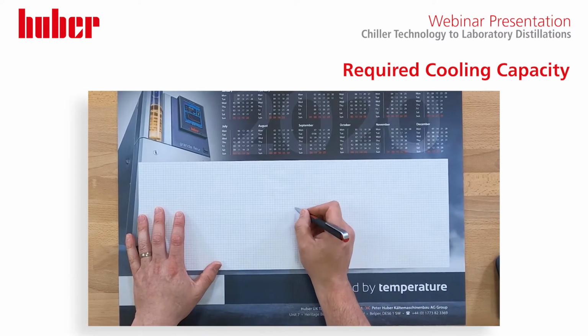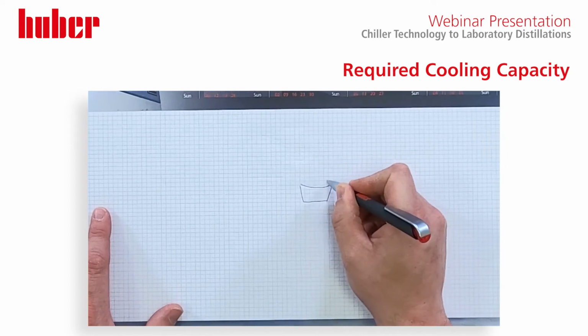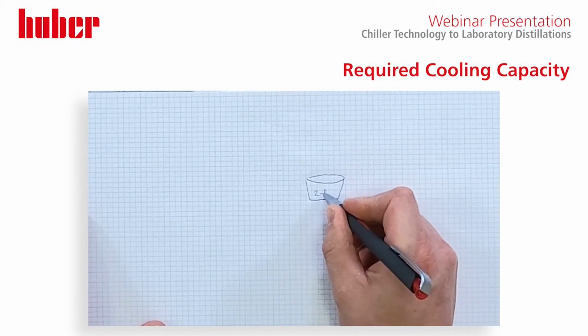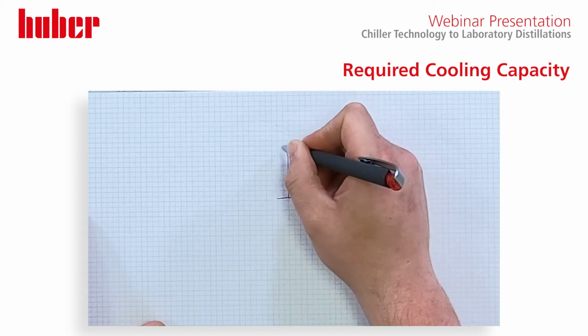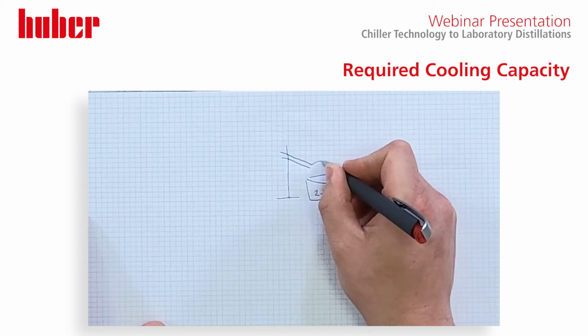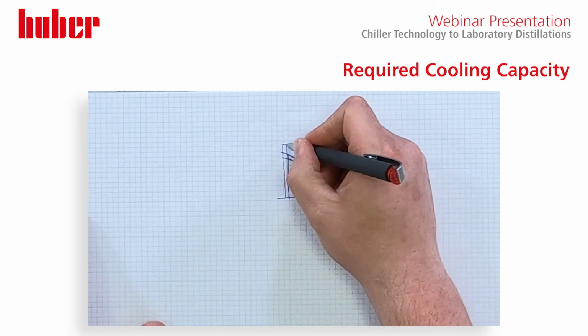So to do this, let's first just draw out the application, so we understand where things are coming from. In a rotary evaporator, you have a heater bath that's typically 2 to 3 kilowatts of heat. We have a motor which rotates our flask, which holds our mother liquor.